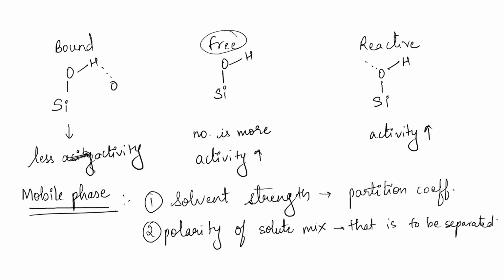Now there are different mobile phases that one can use. Acetonitrile is one of the mobile phases. Then you can see there is methanol. H2O is also one of the mobile phases, because when you talk about biomolecules, they have more solubility and more affinity towards water. So yes, H2O can also be a mobile phase. Okay, so this is all about adsorption chromatography.